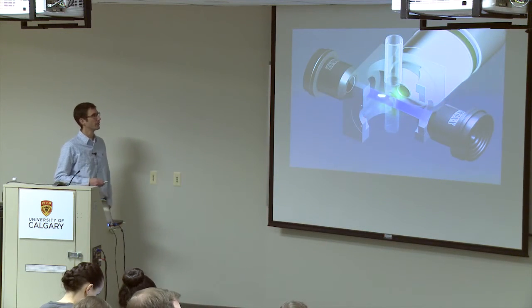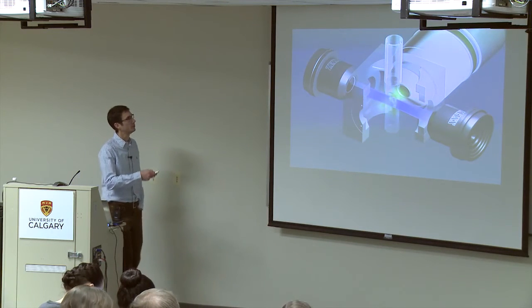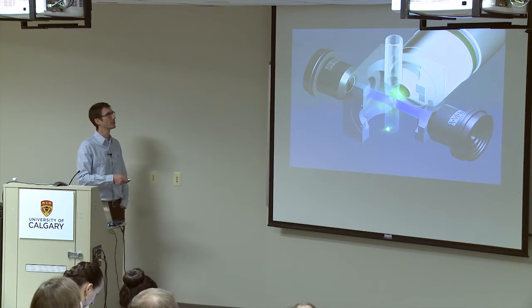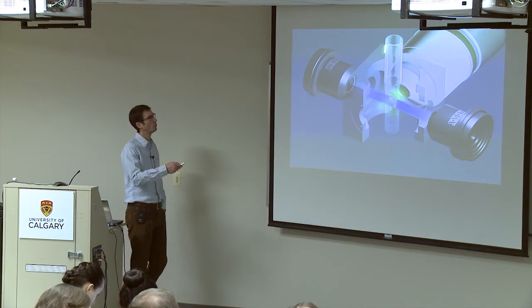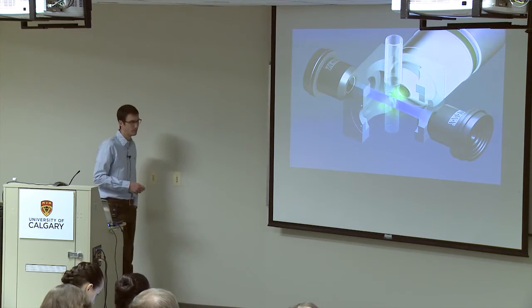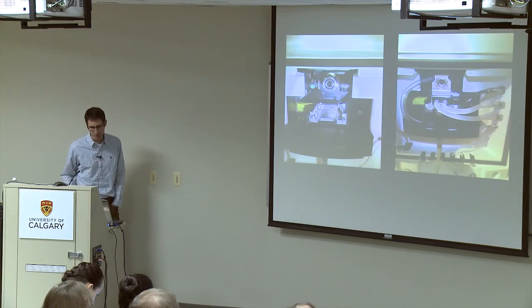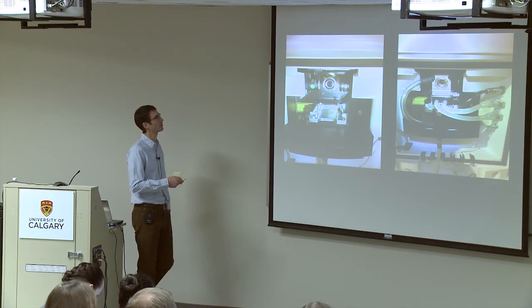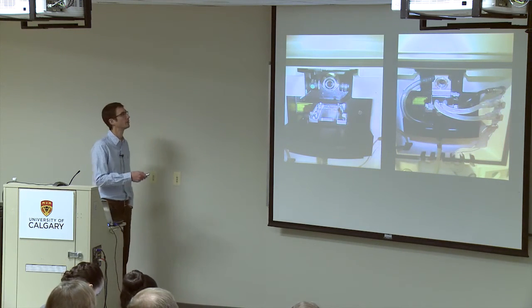Here's the picture that we've seen 1,000 times already, just reminding you that we're not dealing with cover slips and microscope slides anymore. What we're dealing with is some sort of cylindrical tube that's holding our sample. And there's a few options here. This is just a couple of pictures of the inside of the microscope so you can get an idea of what's going on inside here.